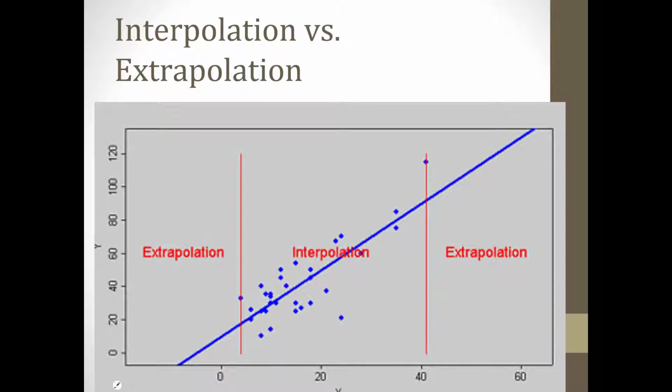And the units have no real meaning on this example. But let's say we give you an unknown concentration, okay? So some unknown concentration of beta-cyanin, and it falls right here on the graph. Well, you'll be able to figure out what that concentration is using your standard curve.